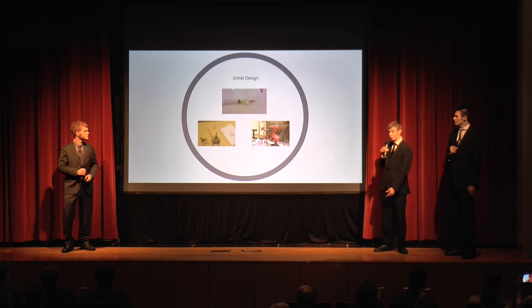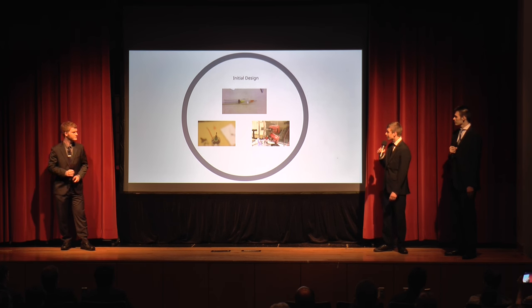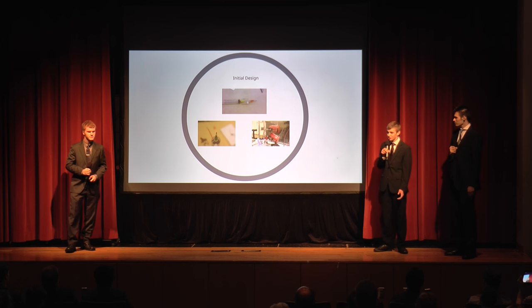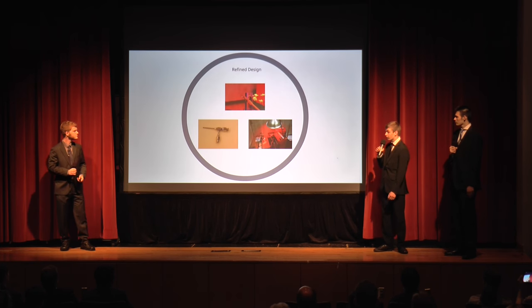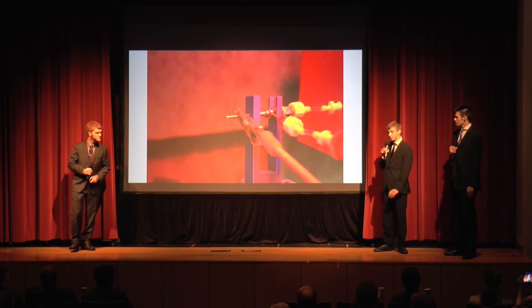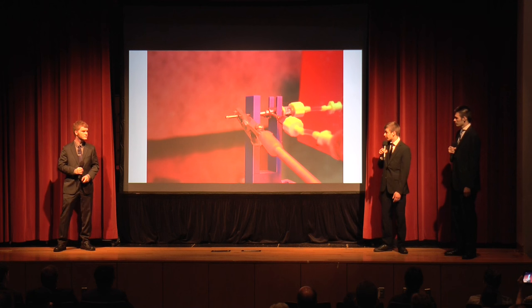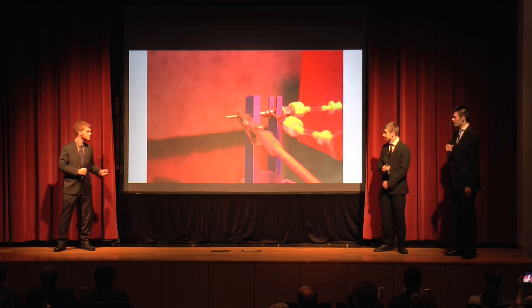To achieve that, we took one syringe and put it inside another one. It was really that simple. But our issue with our design was that it was cheap plastic and it moved around a lot. It wasn't very efficient. So we decided to buy a Ramé-Hart needle, which was metal, rigid. Metal was perfect. Not only was it rigid so it wouldn't move and the alignment stayed perfect, but it also conducted really, really well, allowing our solution to be pulled very easily. Here we have the attached tubes to syringe pumps, allowing it to flow to create our polymer.